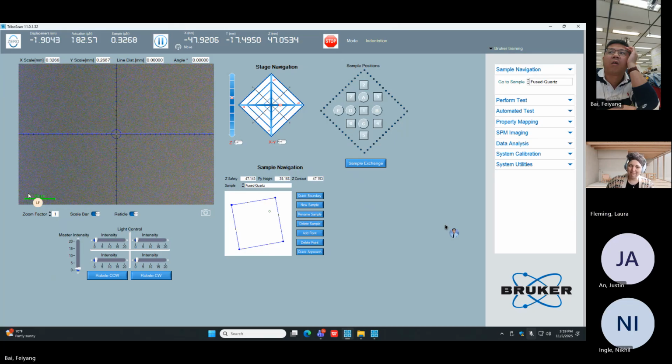But the TS77, I think, has a guaranteed repeatability of either 10 or 15 microns. So that's something to keep in mind. Most do better, but I can't guarantee that it will repeatably find those composite parts.